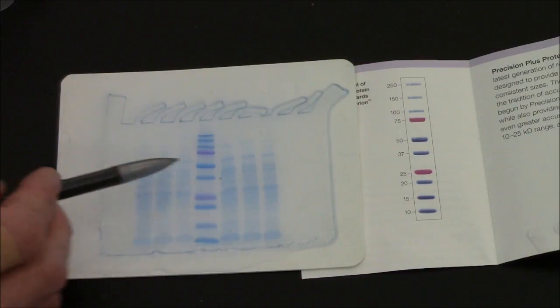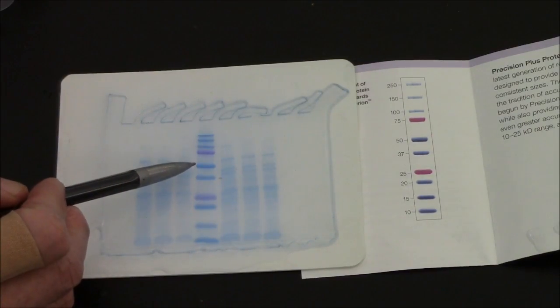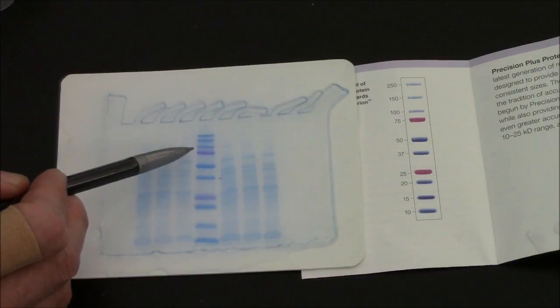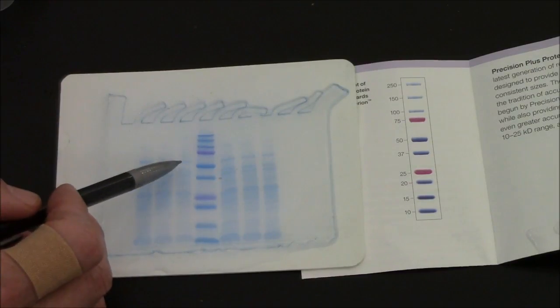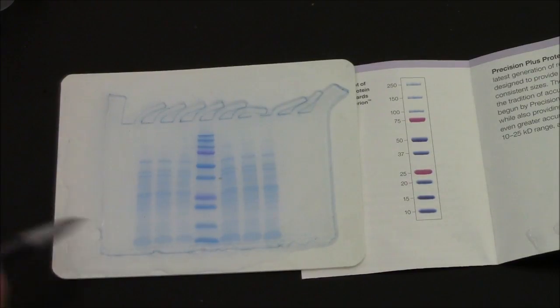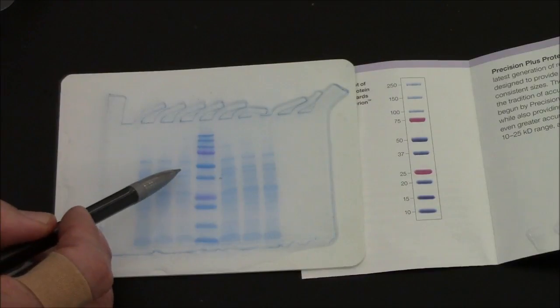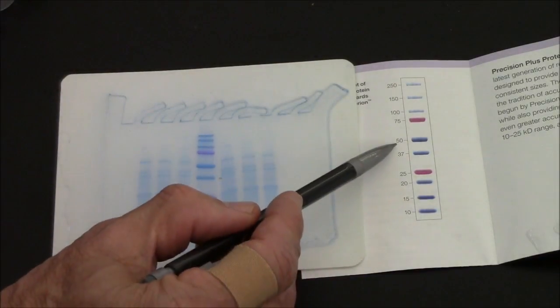This band here is between the 50 and the 75 kilodaltons. So it's probably something like 55 KD. 55,000 is its molecular weight. These two bands on the other hand are between 37 and 50.